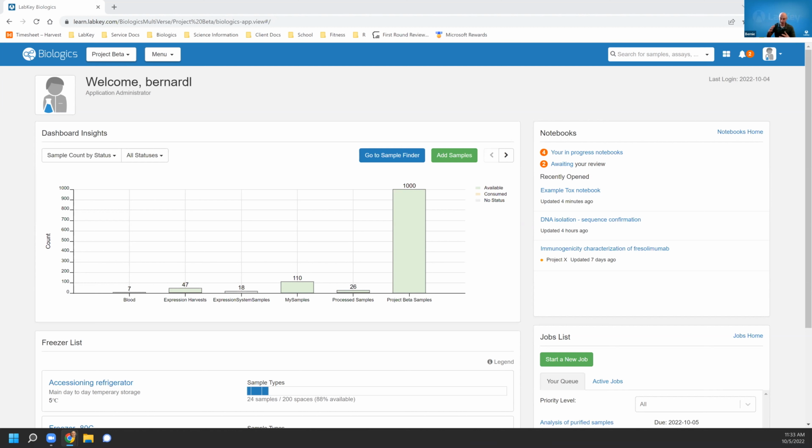And it's easy then to aggregate data that's important to you for any kind of reporting or, say, IND submission. And by using a system like this at the organizational level, you have that shared language. But you're also really encouraging people to do lab work a little bit differently, I think more efficiently, once you adapt to the enforced changes of working in a standardized system. And then I think ultimately that raises the data informatics intelligence of any organization that does this.